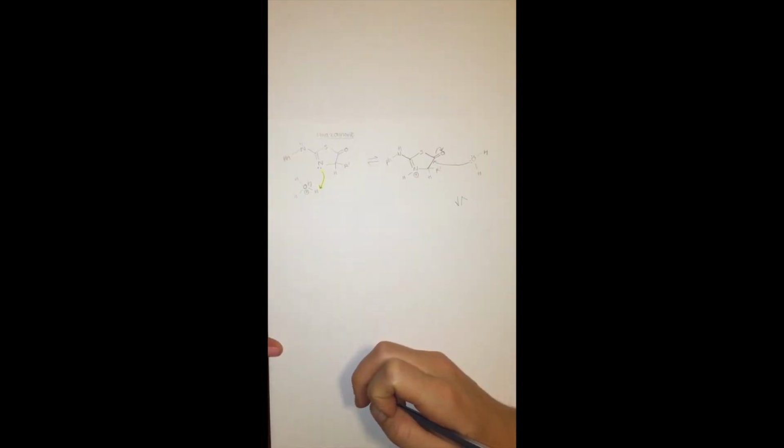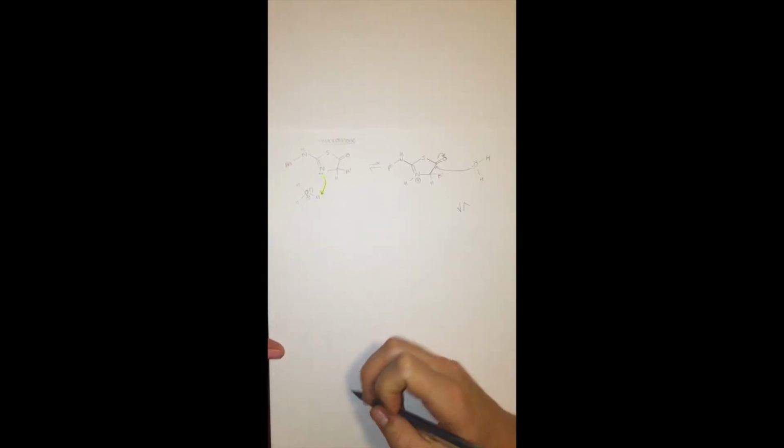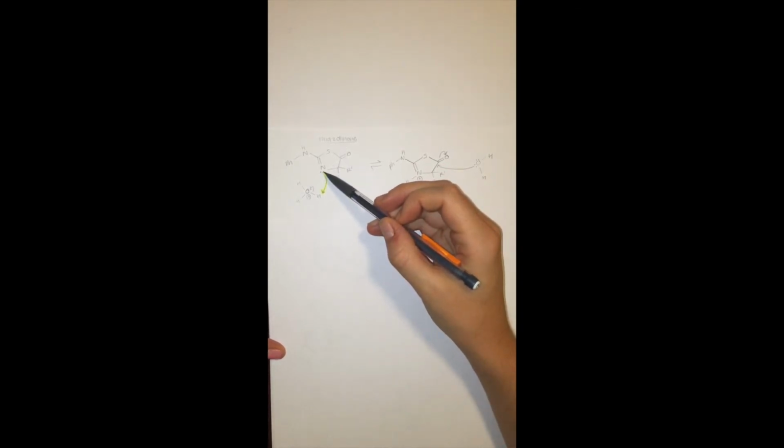The thiazolinone group then undergoes a rearrangement. It is first protonated by an acid at the nitrogen, which activates the electrophilic character of the carbonyl carbon. A water molecule then comes in and acts as a nucleophile, attacking the carbonyl carbon, which pushes the electrons up onto the oxygen. We then have a tetrahedral intermediate, which collapses back down to reform the stable carbonyl, and with that breaks open the cyclic structure by breaking the carbon-sulfur bond, which has a cascade of electron flow.